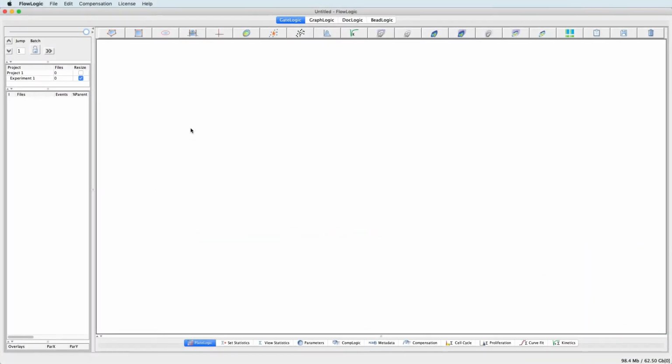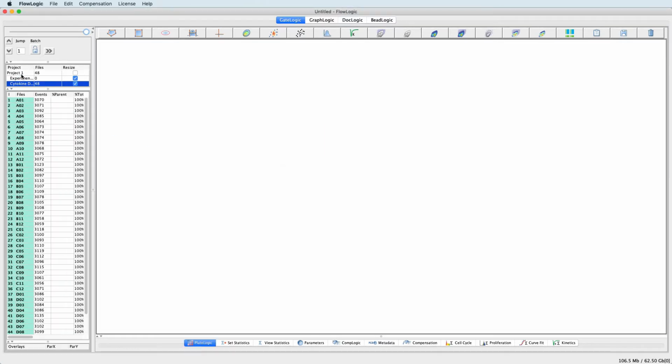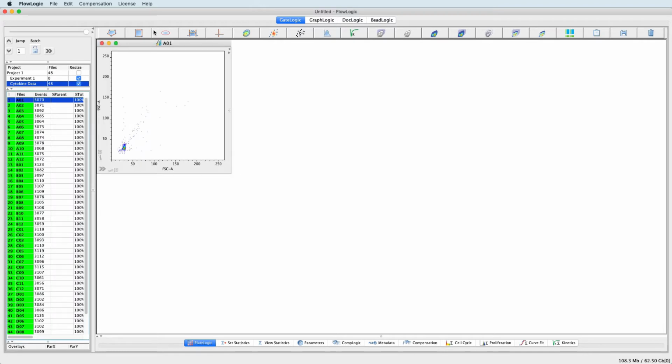When analysing flow cytometry-derived multiplex bead array data, perform the initial setup in PlateLogic before continuing the regression analysis in BeadLogic. Here I'll import my FCS files, which include my standards and unknowns. I will then add these files to a group, and then continue to gate on the bead populations to identify the different analytes.